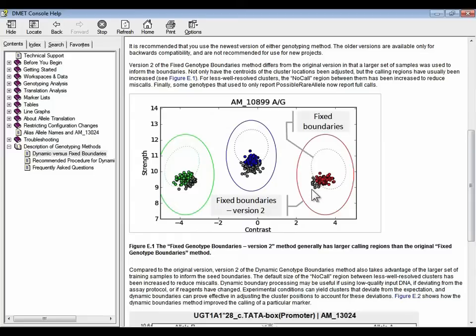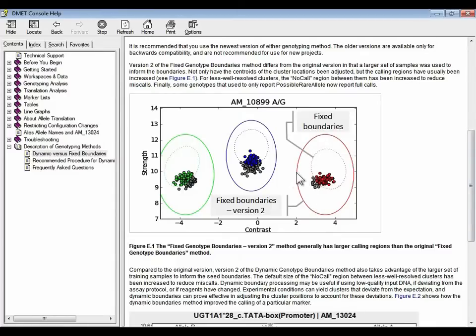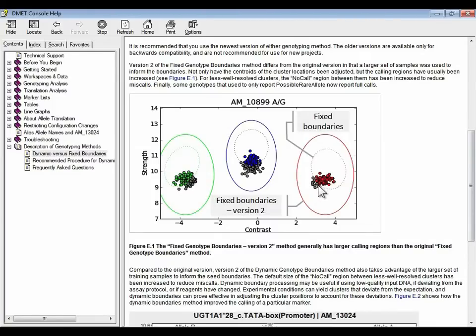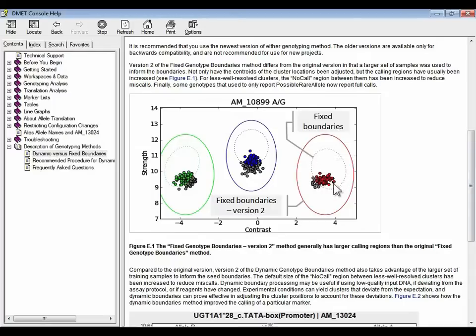So what we've done in the updated version of the fixed boundaries is expand the boundaries for well separated markers to improve the call rate without sacrificing accuracy. And so these additional gray no calls will now be assigned calls. So that's the updated fixed method. With the fixed method, the boundaries are fixed. They do not move. Whether you throw one sample into the analysis or a thousand samples, the boundaries are what they are. The genotypes from one sample don't influence the genotypes that are calculated for the other samples.